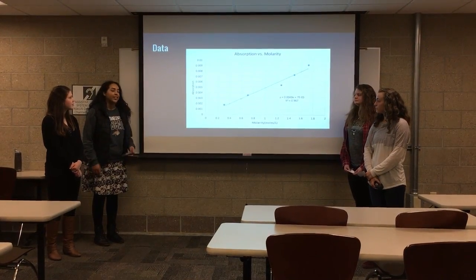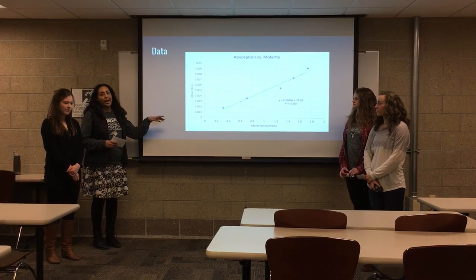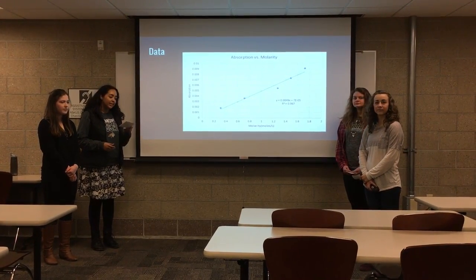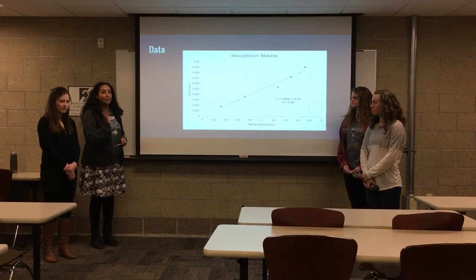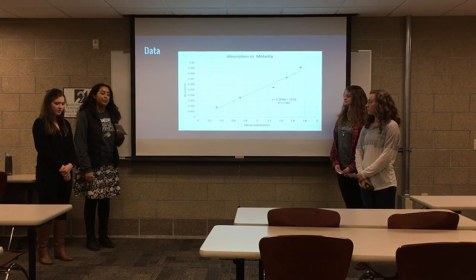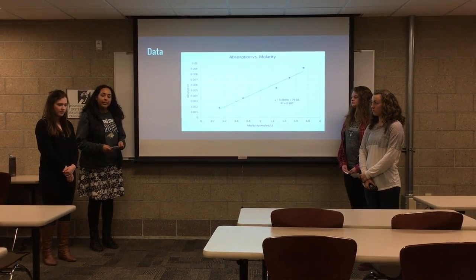And using our last data table, we graphed absorption on the y-axis versus the molarity of the solution on the x-axis. And after fitting a trend line to the graph, we found that the relationship between absorption and molarity was a positive correlation, which means that whenever absorption increased, the molarity also increased.